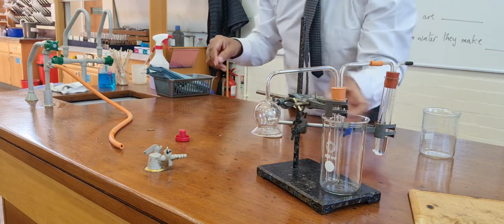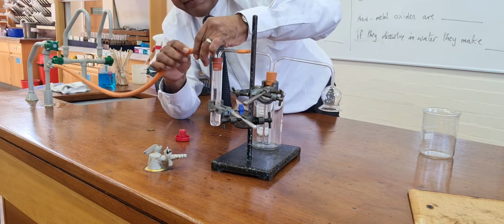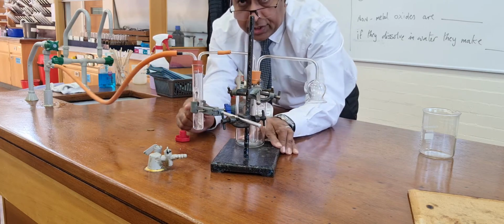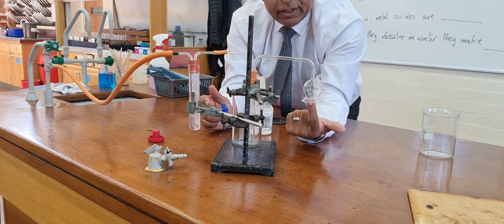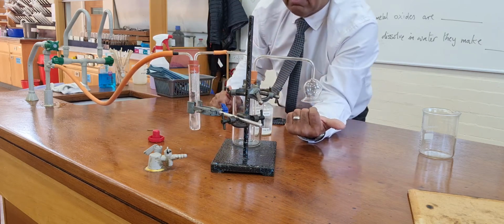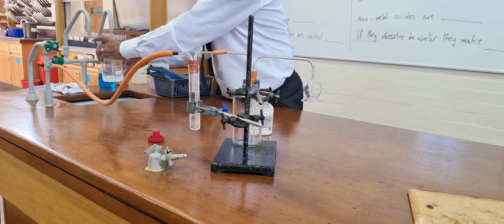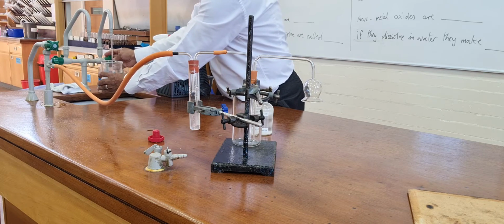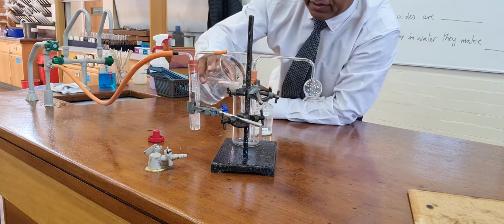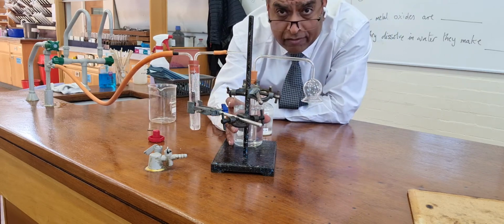Okay, so just turn it round, suction, I'm going to put on the end of this here. And immediately you can see the air is being sucked from here through there. Now, we need to put some water in here. So if I get water, I put water into the beaker to give me a cooling effect.